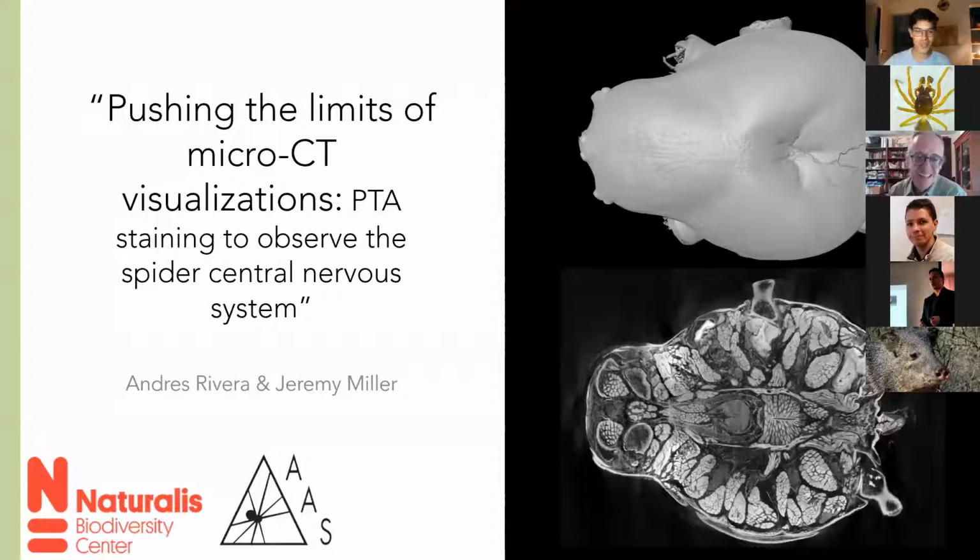Thank you for the introduction, Brian. I'm going to show you here the results of a first step in a series of studies that Jeremy and I have been doing about the spider brain, and it's a new staining protocol that allows visualizing the whole internal anatomy of the spider, but that we have been using for observing and characterizing the central nervous system, and specifically the brain and the visual pathways.